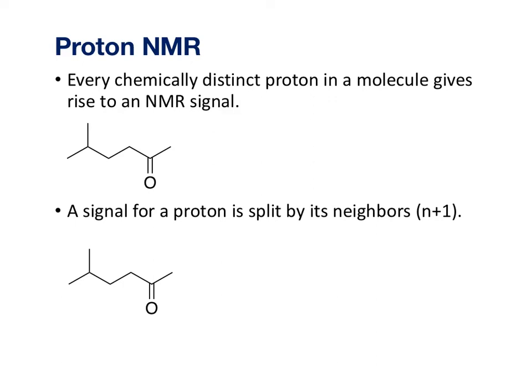NMR is quite a detailed, lengthy topic that I'm really going to try to condense here in just a few slides to give you the basics. We're going to look at proton NMR. So this is showing us the protons in the molecule, the hydrogen. Every chemically distinct proton in a molecule gives rise to an NMR signal.